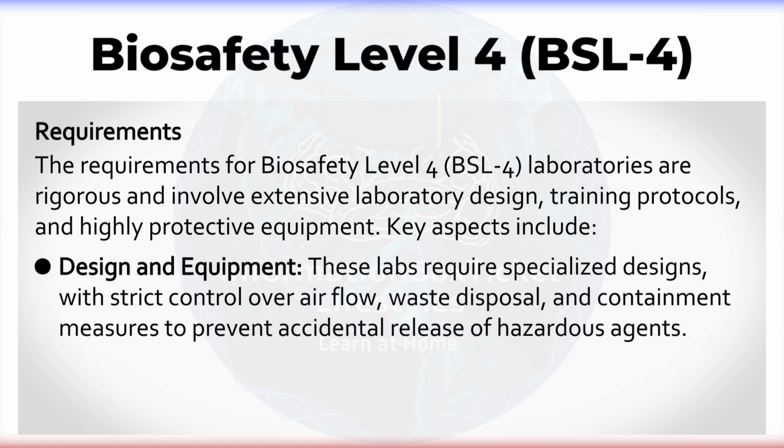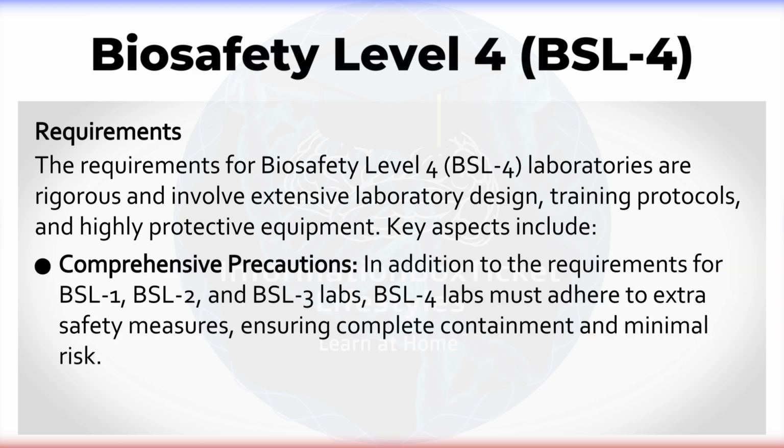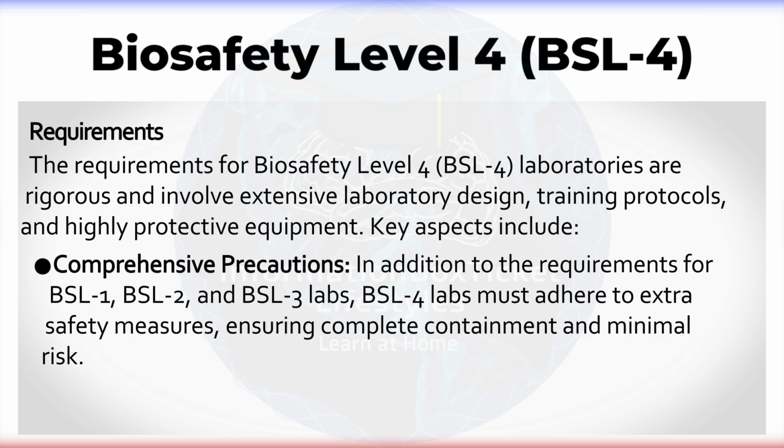These labs require specialized designs, with strict control over airflow, waste disposal, and containment measures to prevent accidental release of hazardous agents. Comprehensive precautions. In addition to the requirements for BSL-1, BSL-2, and BSL-3 labs, BSL-4 labs must adhere to extra safety measures, ensuring complete containment and minimal risk.